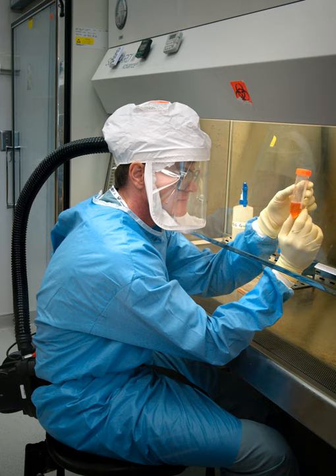This is complicated, since the smoke split, demarking the rear of the cabinet, is an invisible line that extends the width of the cabinet approximately 10 to 14 inches from the front grille and drifts as the internal HEPA filters load with particulate. The Type B2 cabinet, also known as a total exhaust BSC, is expensive to operate because no air is recirculated within. Therefore, this type is mainly found in such applications as toxicology laboratories, where the ability to safely use hazardous chemistry is important.